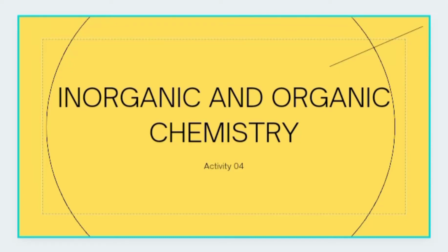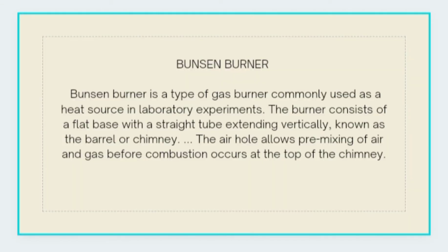So this is my Activity 4 in Inorganic and Organic Chemistry: the Bunsen burner. So what is a Bunsen burner? A Bunsen burner is a type of gas burner commonly used as a heat source in laboratory experiments.